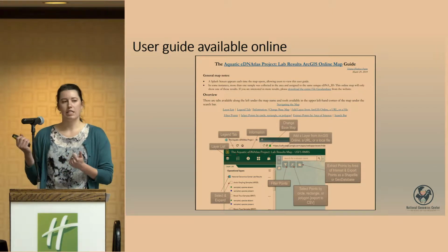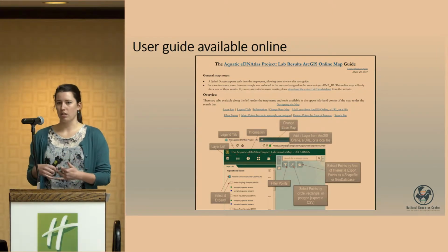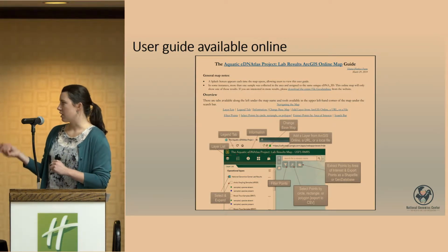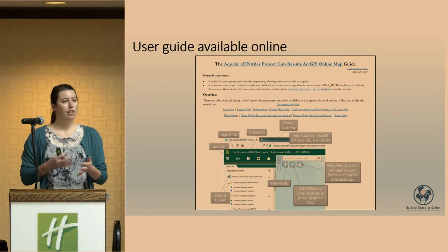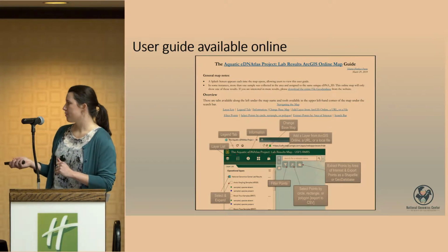As far as navigating the websites, there is a user guide available online, so you can download this and it will help you navigate the tools on your own. But I'll take the next couple minutes to show a couple notable features of the atlas to familiarize you with it and get you thinking about how you might be able to use the atlas.